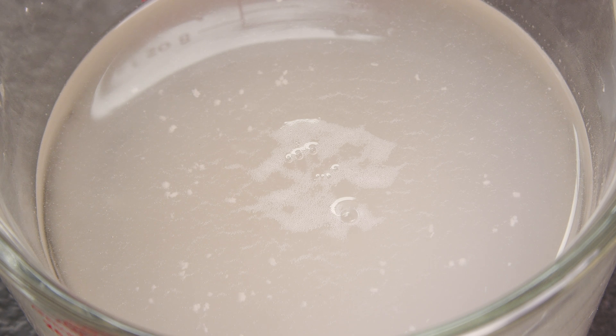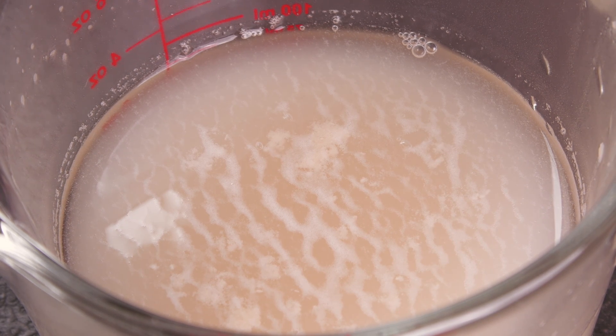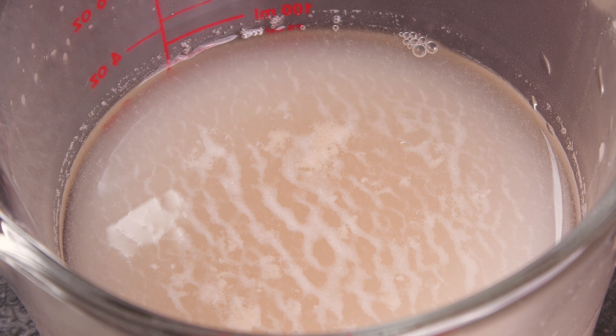Naturally the amount of this that you will see will be determined by how much yeast you actually added. In this first example a minimum amount of yeast was used, but do not be afraid to add more. Here is an example where more yeast was added at the start — the signs of viability are larger, and some people prefer to go this route to be sure.